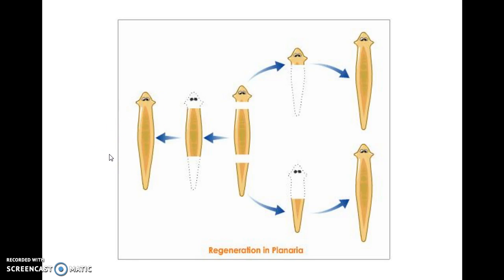And there's certainly many other things that could kill the planarian, like poor water quality, a lack of food, things like that too. Okay, so one of the slides is of a whole planarian, and I'd like you to measure it and answer some questions about it.